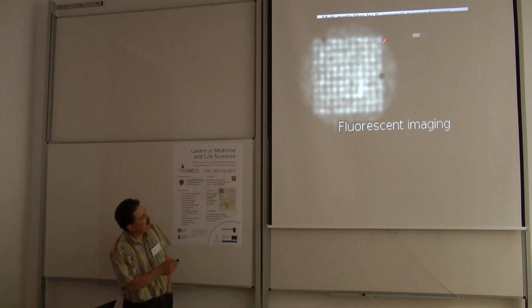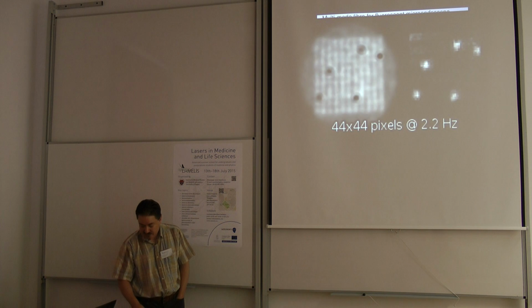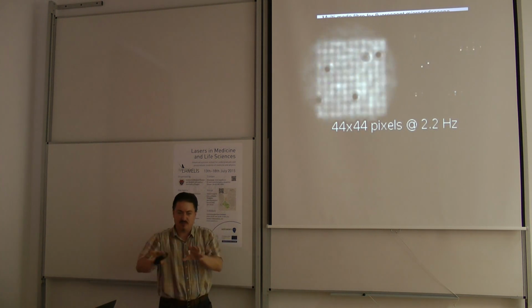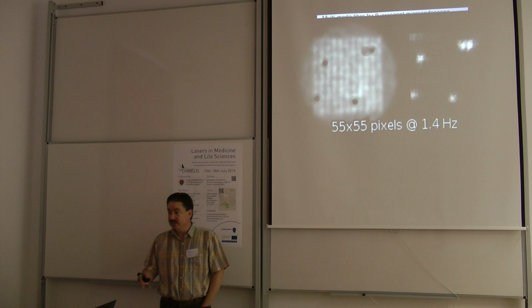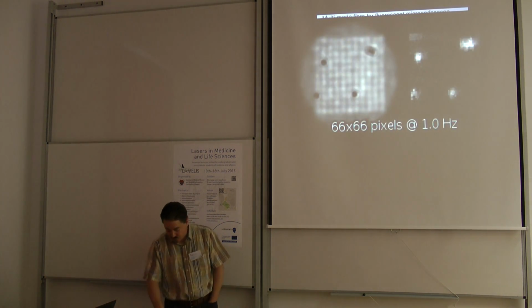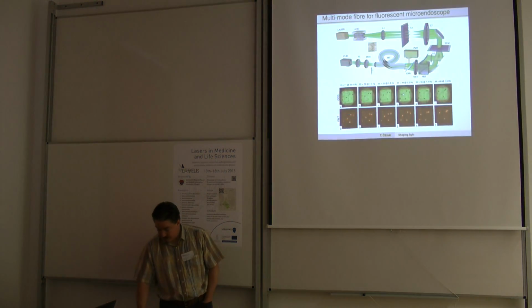The resolution, just like this, was really weak. But I could play tricks. I could not have the SLM entirely static. But I could interlace a couple of different holograms and shift the positions around and then reconstruct the image numerically. So there is a trade-off between resolution and speed. You can choose what you want, right? But it got somewhat decent for relatively small things.